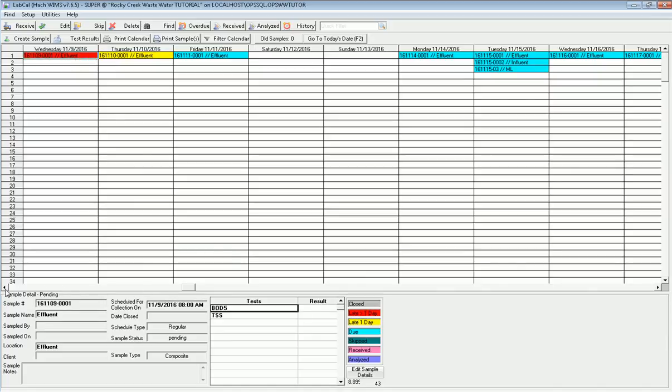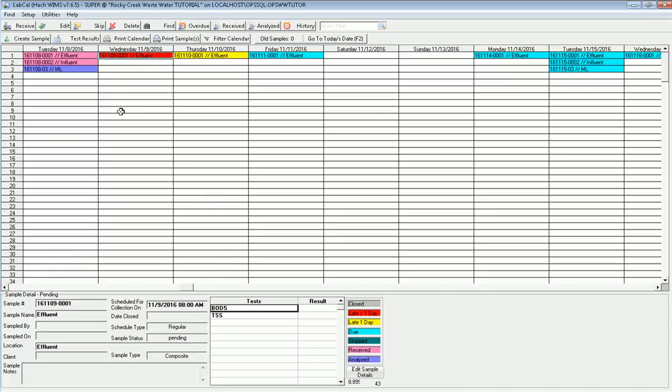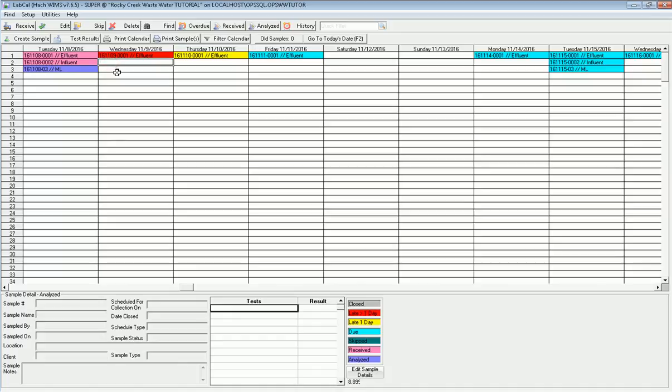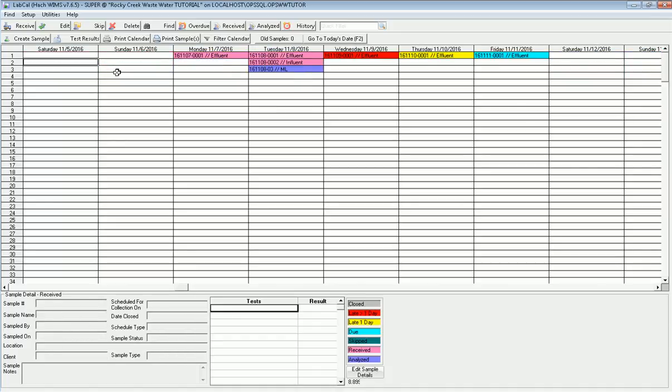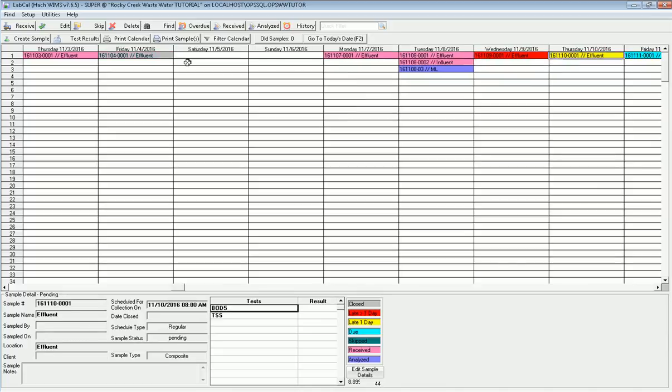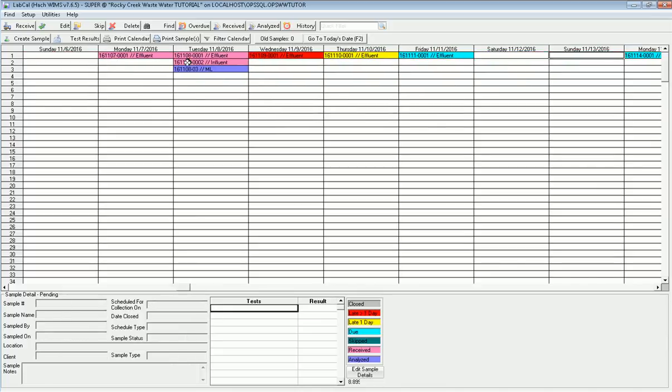The colors indicate what's happening. This sample has been received, meaning you've said who sampled it and when it was actually sampled. However, no results have been entered. The purple color means that it's been analyzed and it's ready to be closed. A gray color means the sample has been fully entered and has been marked as closed, which means the data is in the database and it's all good. That's the kind of life cycle of a sample. It goes from scheduled to received to analyzed, and then you close that sample out.